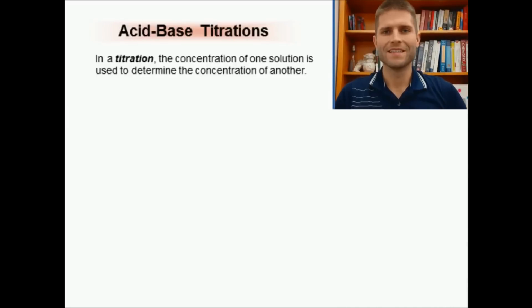Hello all. In today's video we're going to be discussing a new use for our understanding of molarity. This is a technique that we're going to use regularly when we're in the laboratory. A lot of times when you go into a stock room like we have downstairs, there are bottles just lying around that have what's in the bottle, like hydrochloric acid or sulfuric acid or phosphoric acid.